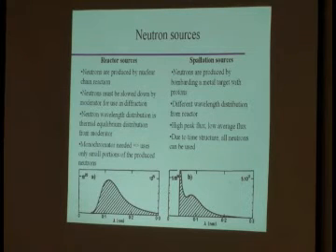Now that means that what you do at this point in time is fairly similar to an X-ray experiment. You need a monochromator, you choose your wavelength, and you take a small cut somewhere out of this thermal equilibrium distribution, and those are the neutrons that you use. So the problem is you throw away a lot of neutrons. Okay, and it works pretty well, and you have a pretty decent peak flux. Okay, but that is why people started developing spallation sources.